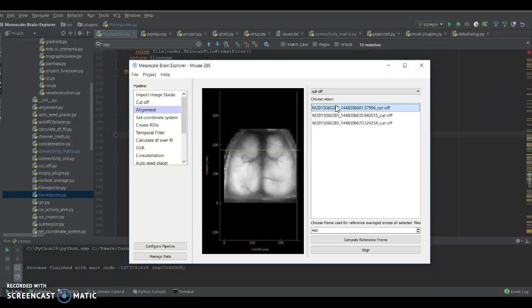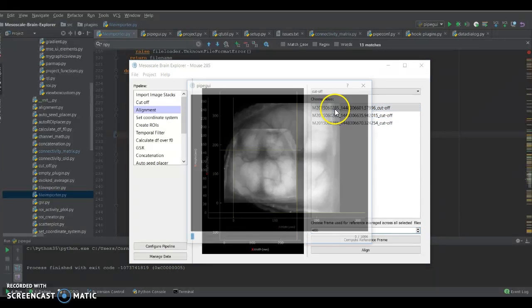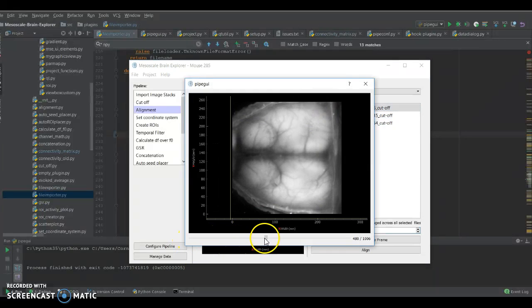So how do we select it in the plugin? As it is in its current incarnation, we pick a particular number of image stacks. So over here we'll pick 3. Over here we pick which frame we want to select from those image stacks. For each of these we'll take the 400th frame, which is nicely in the middle. As you get close, we can use the keyboard if you want to be very exact. So the 400th frame from each one. Okay? That's what this plugin is doing.